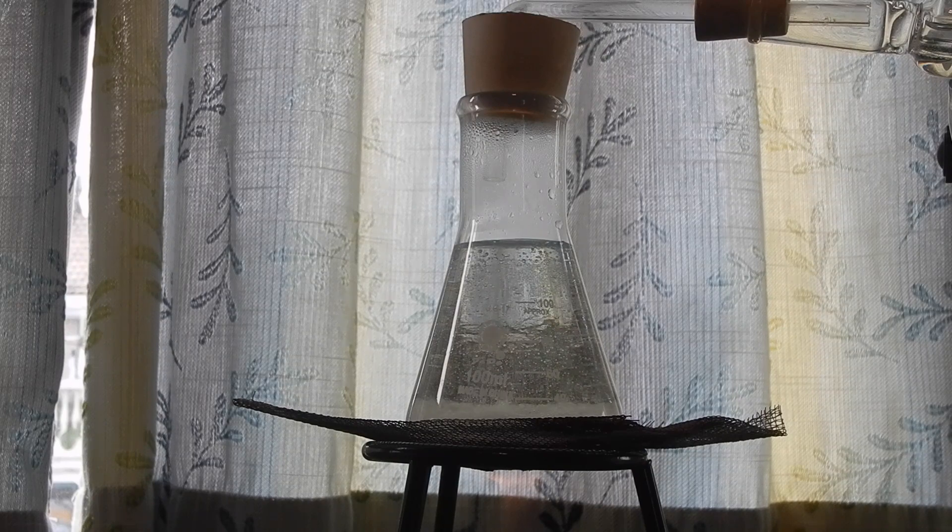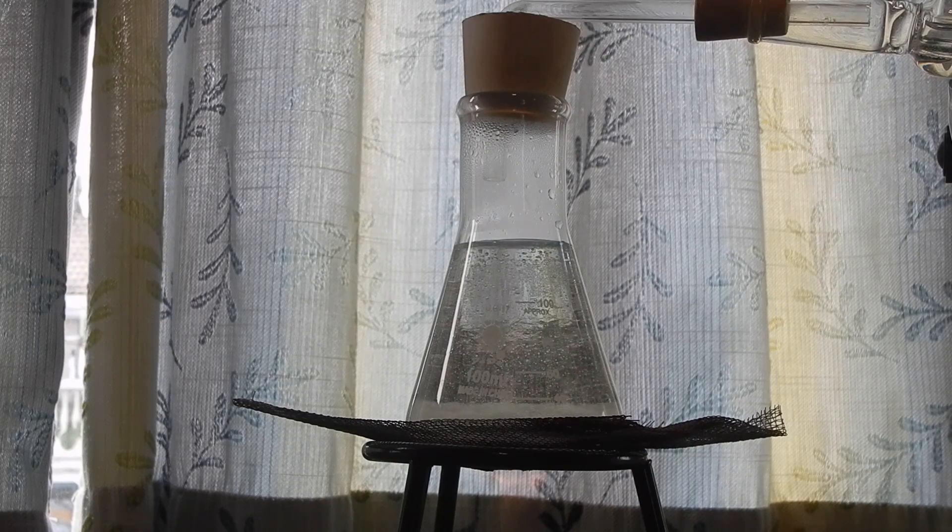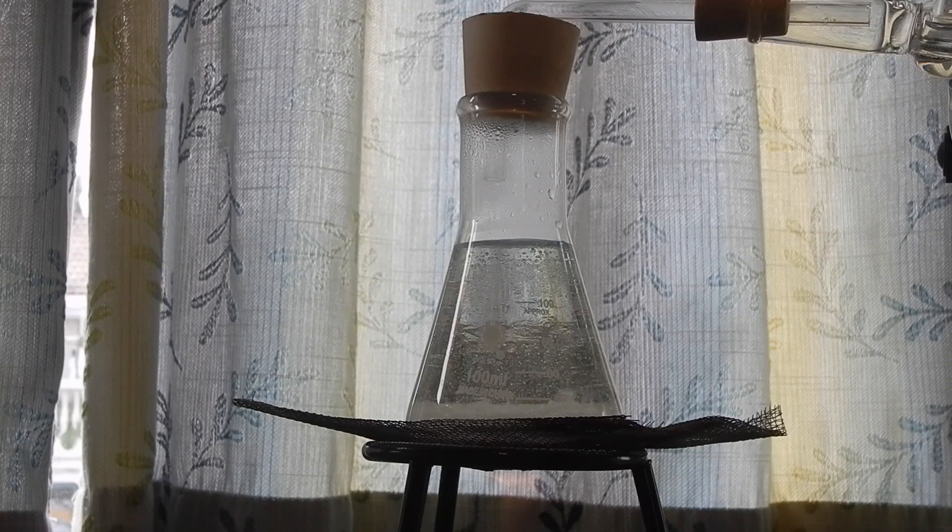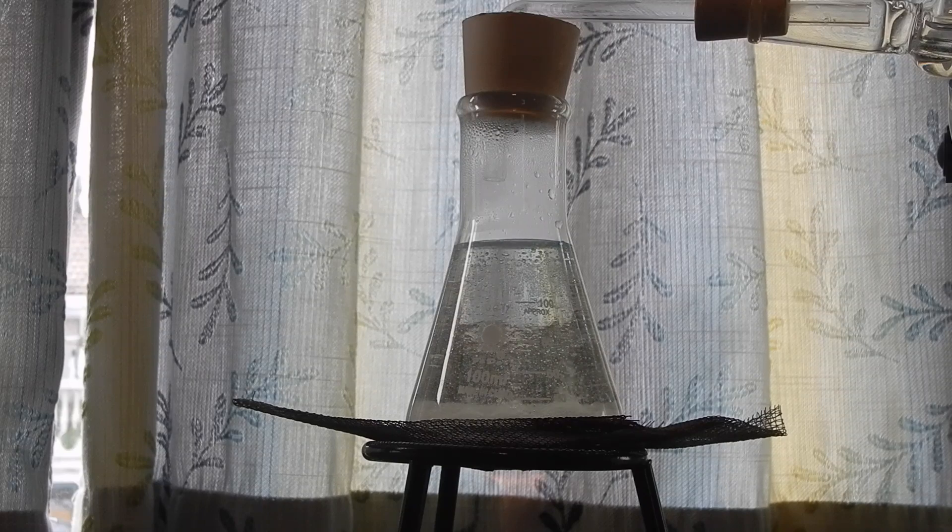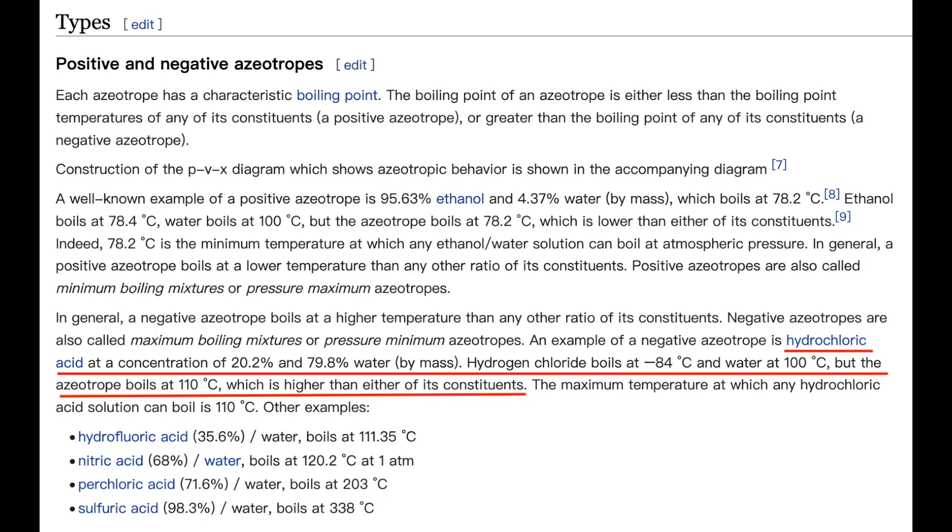Also, note that we added some water to the flask when we started. The water and the hydrogen chloride forms something called an azeotrope, which means that they boil at the same temperature. This makes it far easier to collect the acid produced, since hydrogen chloride is a gas at room temperature, but the azeotrope is liquid.